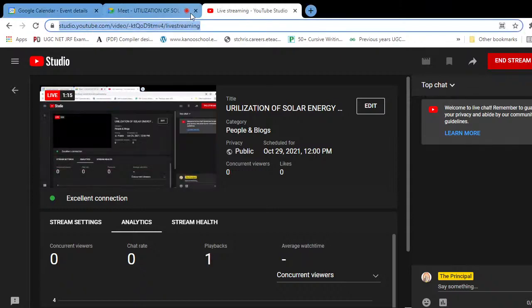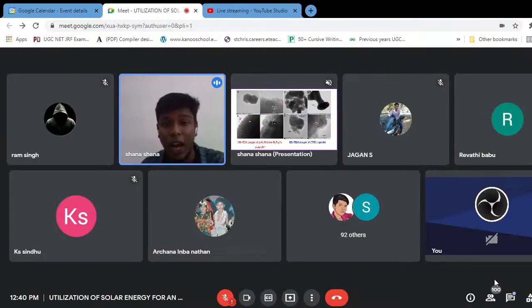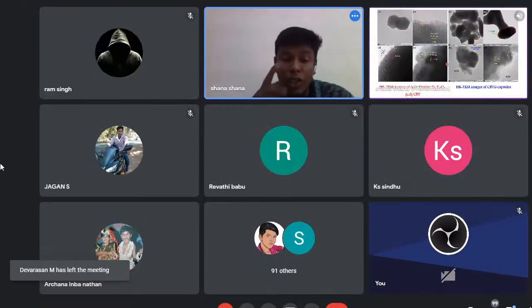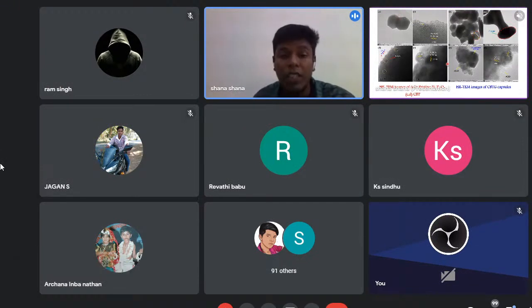More in-depth morphology is studied in a transmission electron microscope, where you can see very interesting things. You can explore materials at the nanometer size also. Here you can see patterns of almost 0.2 nanometers, which is a lattice pattern.